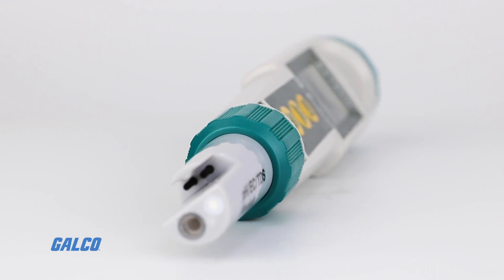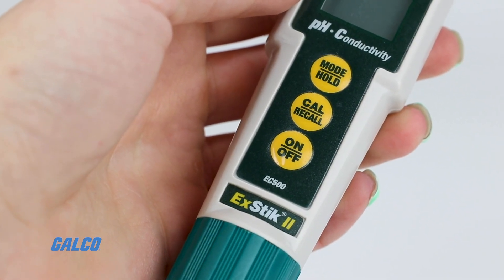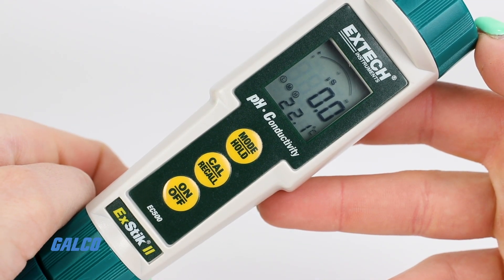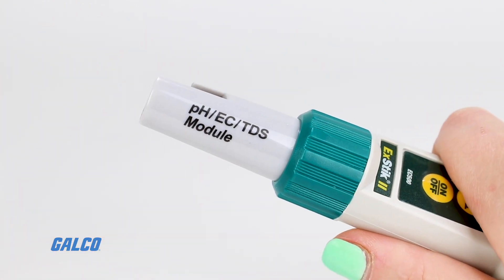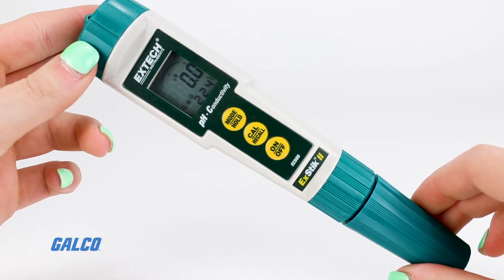Onboard storage can recall up to 25 labeled readings. Additional features include auto power off and disable functions, a renew alarm when the electrode needs to be replaced, and an adjustable conductivity to TDS ratio.